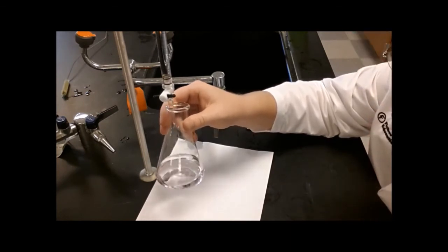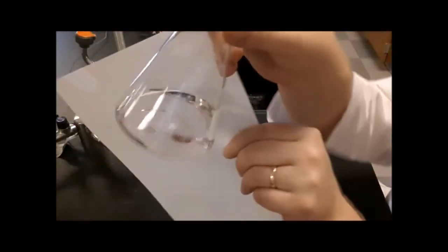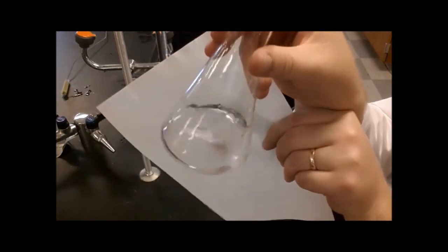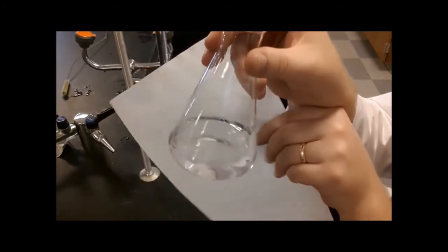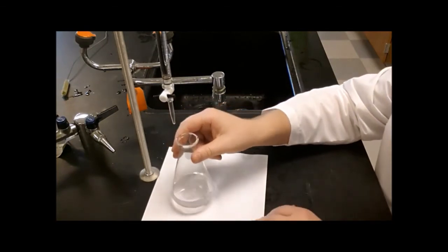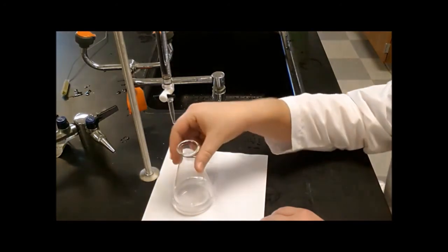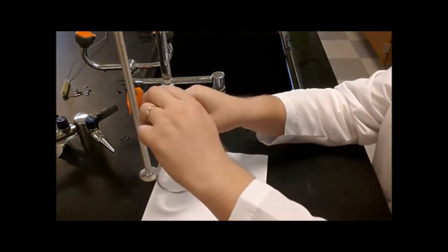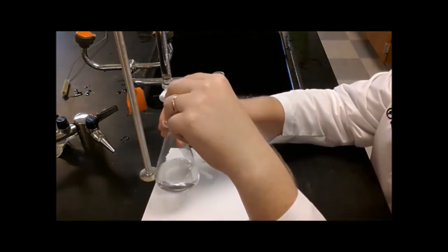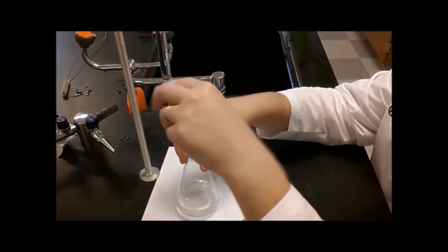All right, it's kind of hard to see, but there's a very faint pink color here. It's not completely clear. If you get to that faint pink color and it sticks around for at least 10 seconds, that's what you're going for. Okay? So I'm really close here. So instead of squirts, I'm going to switch to drops.